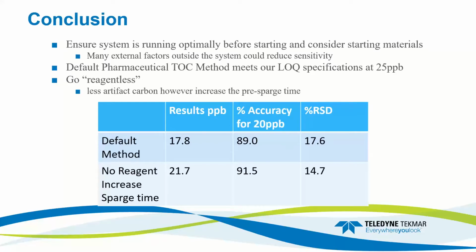One, these tips and tricks can be applied in your analytical troubleshooting. Well, my TC cleans are high. They're staying high. They're not cleaning up. Well, here's a couple places to go look. Let's change the water. Let's acid wash our glassware. Let's go back in and run a 5% acid as a sample to help ultra clean the system inside along with the other material. So there's different things that we can do there.